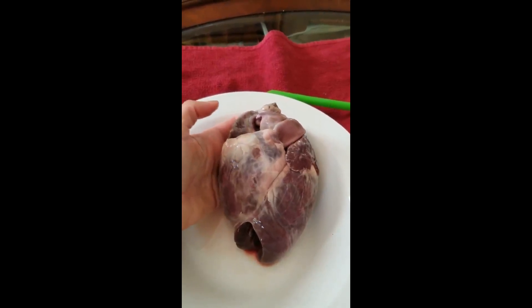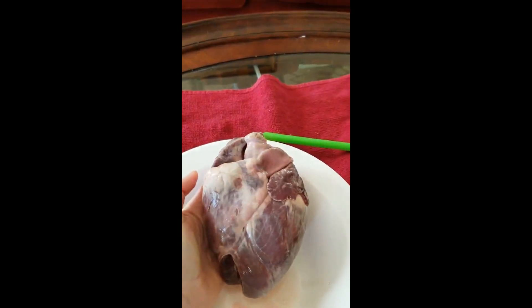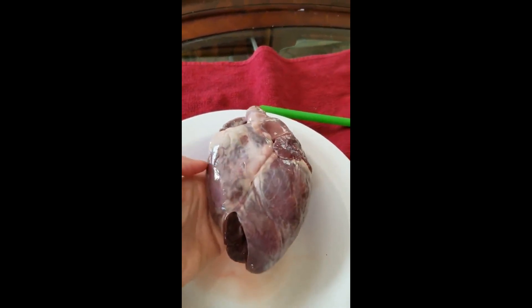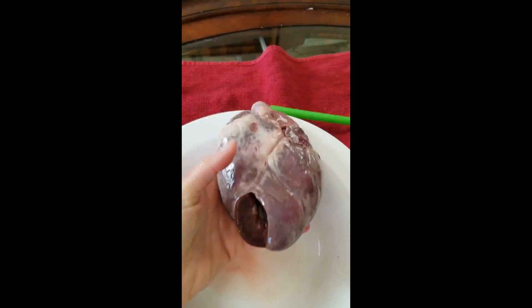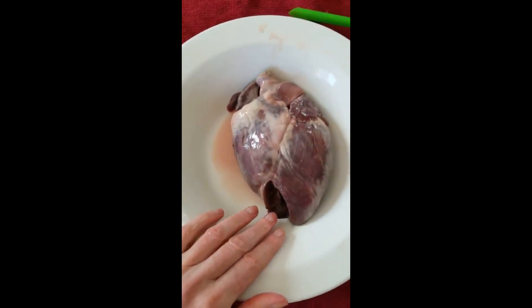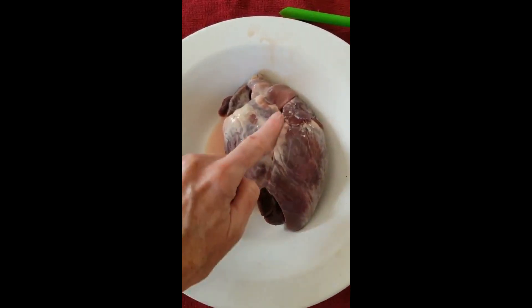This is a deer heart and as you can see it's about as big as my hand. In this case my uncle got this deer and when he was taking it out of the body it got cut a little bit down here at the bottom. This is the ventral side of the heart and we can tell that because we have this nice big vein that travels diagonally.